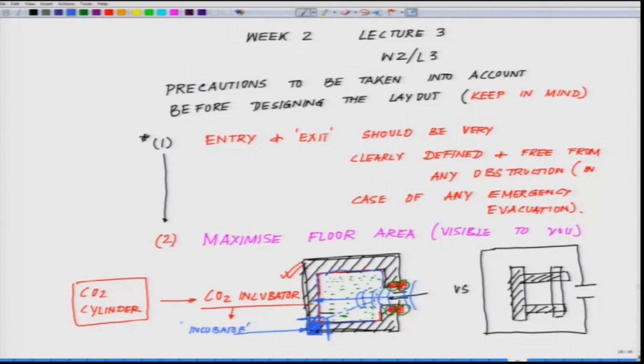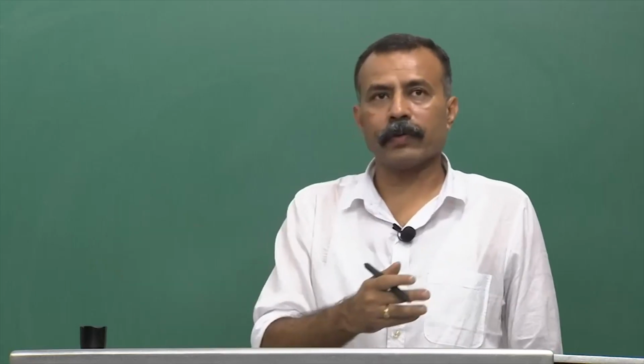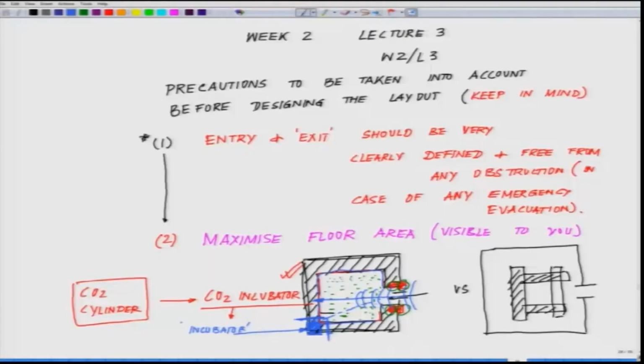Whosoever is entering, there is always an air current coming. So, try to keep it away from that air current zone as far as possible. Your option is that either you keep it here, or you shift it here. These are the two shaded places I am designating for it.